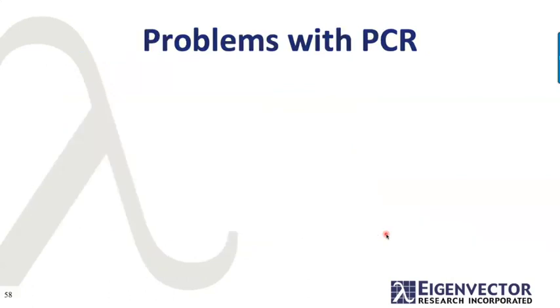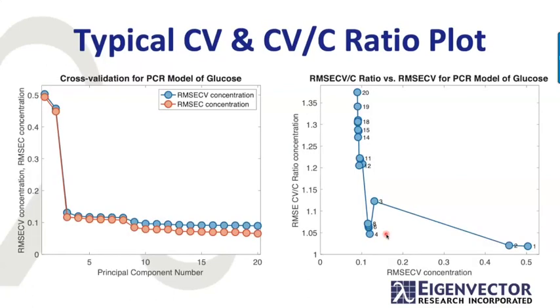Hey Barry, we had a question in the RMSEC calculation. Do you subtract the number of LVs or also one for mean centering in your software? No, we don't. And there's a reason why we don't. It turns out that actually what you're trying to do there is adjust for degrees of freedom. And you can do that in principal components regression, and it's pretty valid there.